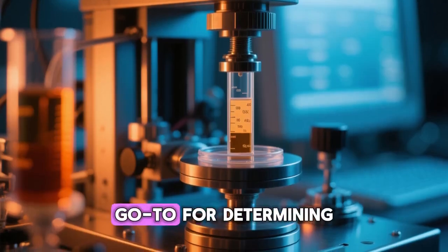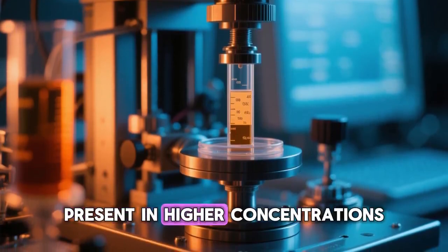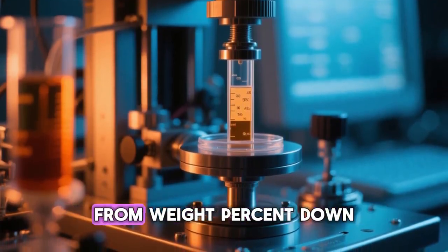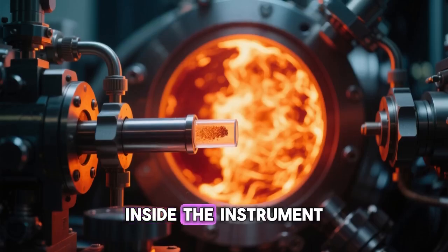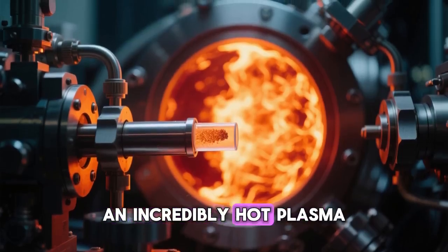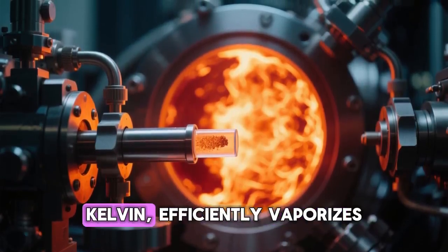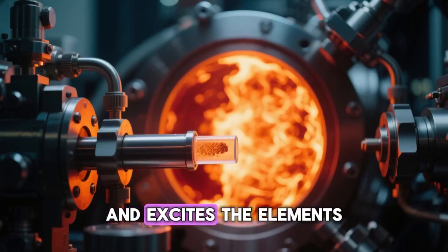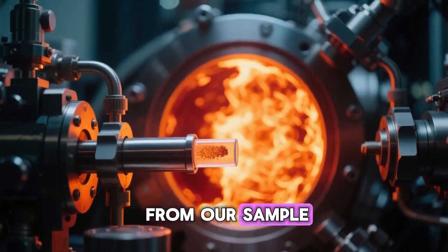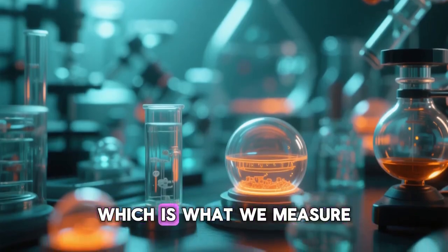Next up is inductively coupled plasma atomic emission spectrometry, also known as ICP-AES or ICP-OES. This method is the go-to for determining major elements and trace elements that are present in higher concentrations, from weight percent down to tens of parts per million. Inside the instrument, an incredibly hot plasma, reaching temperatures of 6 to 7,000 Kelvin, efficiently vaporizes, atomizes, and excites the elements from our sample. This causes them to emit light at specific wavelengths, which is what we measure.